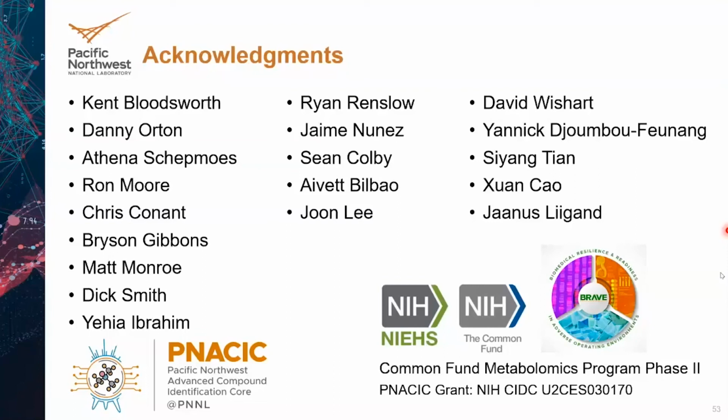We had an experimental data set available to us that was generated by Erin Baker during her time here at PNNL, and it consisted of, I don't remember how many unique molecules, but it was around 2,000 different conformers of molecules and adducts of molecules, so that would include protonated, sodiated, ammoniated forms of metabolites, all of which tend to have different drift times in an ion mobility separation, and then correspondingly different collisional cross-sections.